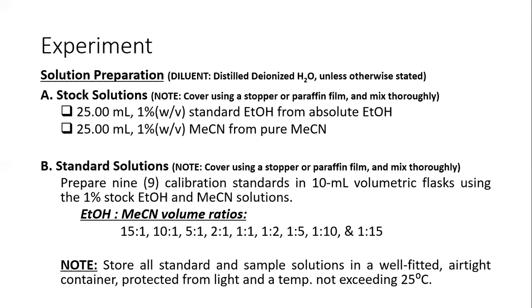These are just the steps for the solution preparation. From the stock solutions, you will prepare the different calibration standard solutions, so 9 calibration standards. In the calibration standards, you will already include a standard of your analyte, which is ethanol. For this particular experiment, we will use acetonitrile as the internal standard.